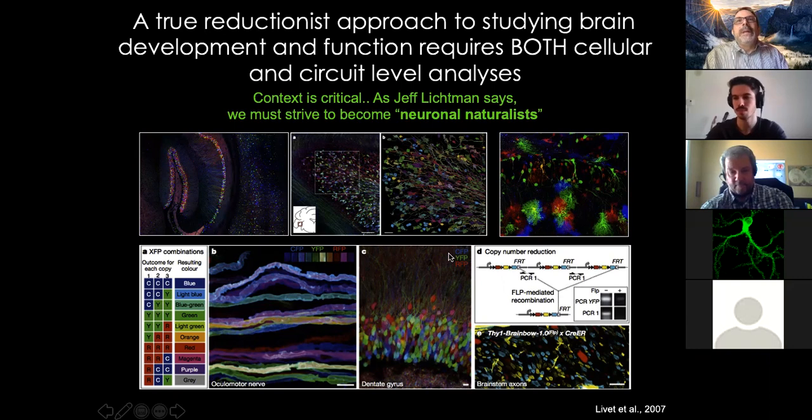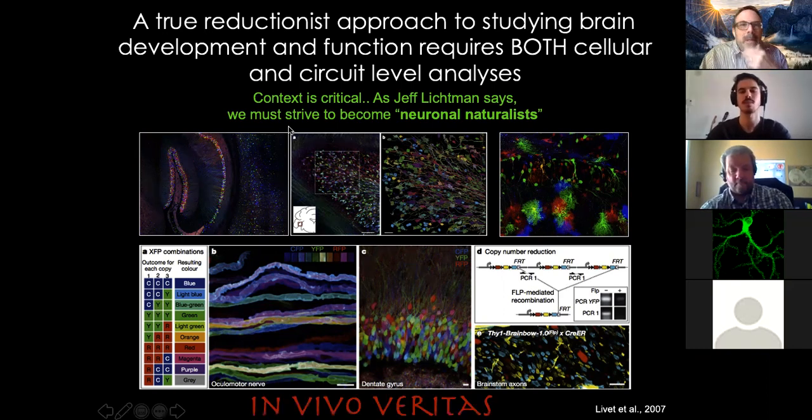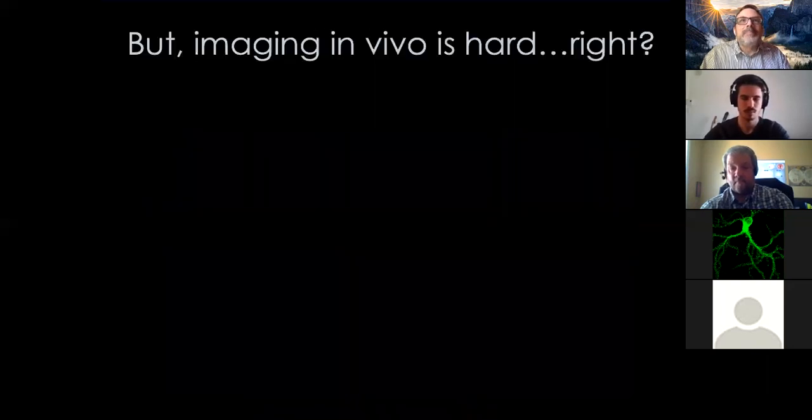So I like the term that Jeff Lichtman uses, which is, if we want to study neurons in their natural setting, we need to all become neuronal naturalists. And this actually is a quote that I stole from Stephen Smith, who was one of the first people to do in vivo two-photon microscopy, in vivo veritas. I think if we really want to know what's the function and the role of cells in the nervous system, we need to go back to the in vivo prep.